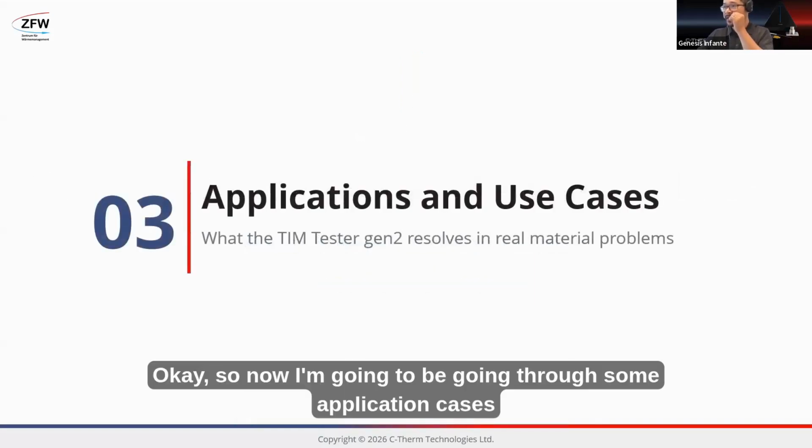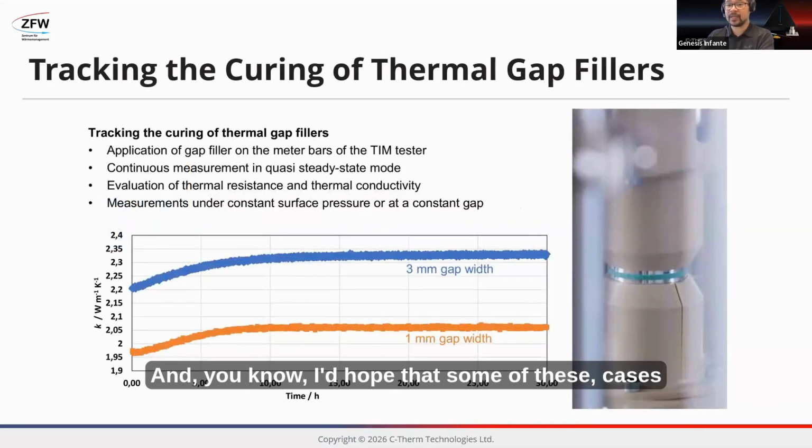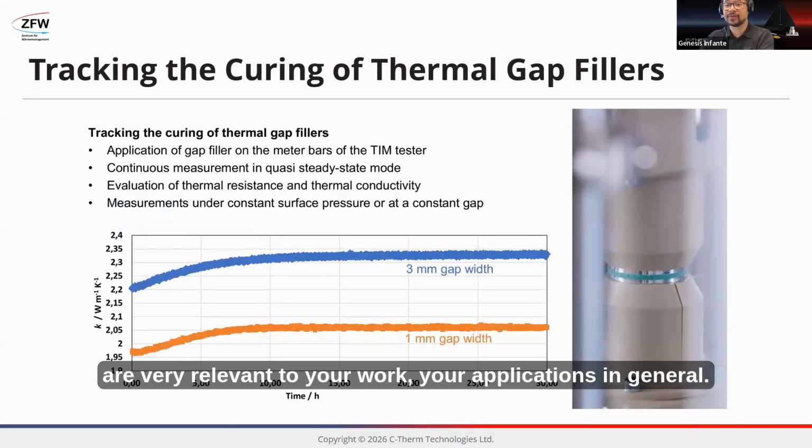Okay, so now I'm going to be going through some applications and use cases that have been done using the ZFW TIM tester. And I hope that some of these cases are very relevant to your work, your applications in general.